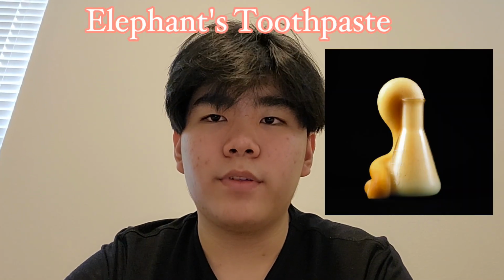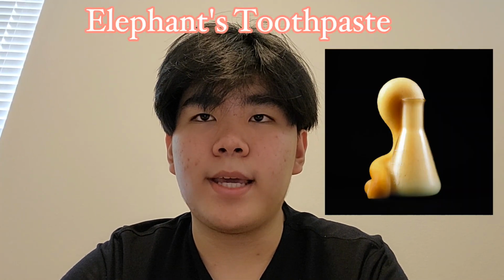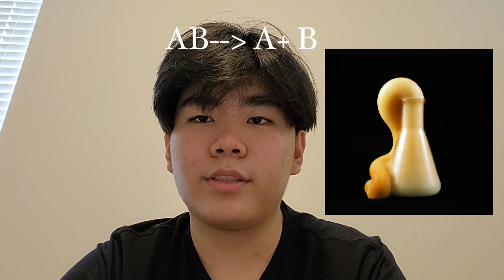The chemical reaction that I will be doing today is elephant's toothpaste. Elephant's toothpaste is a decomposition reaction where a foamy substance is being produced due to the rapid decomposition of hydrogen peroxide with the help of potassium iodide or yeast and warm water as a catalyst.